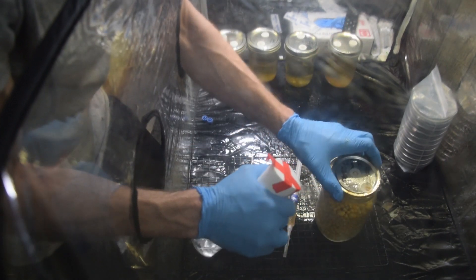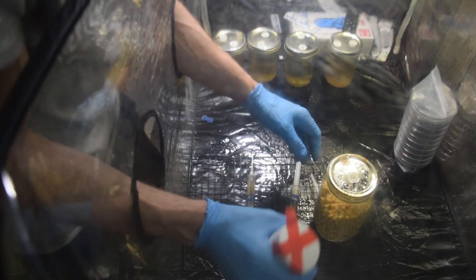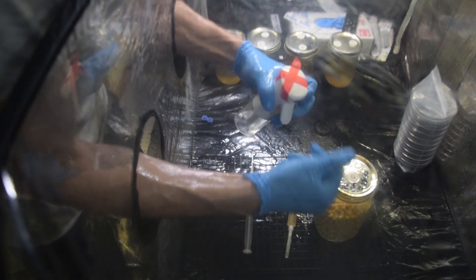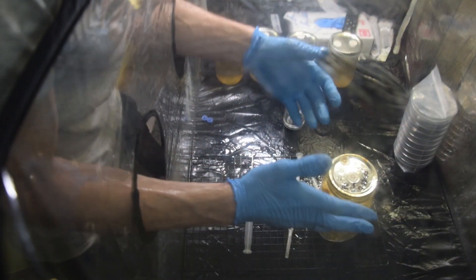So I'm constantly spraying everything down — spraying my hands, my arms as well, and the walls of the still air box.